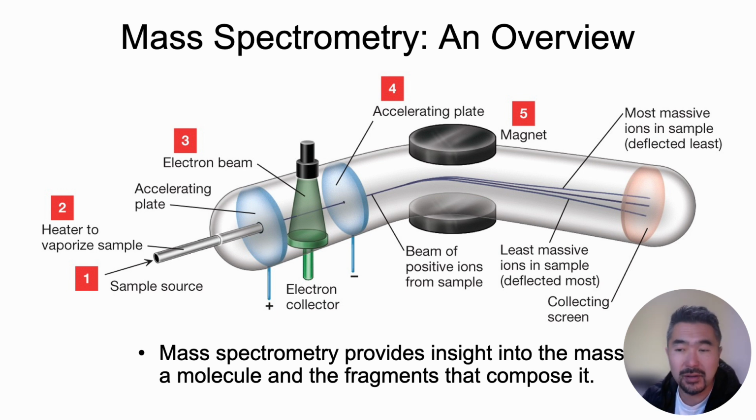This is the first video about mass spectrometry, which again, I hope you're excited about. It's a really useful analytical tool that helps you determine the weight of a molecule. And when you think about it, it's a really amazing thing because a molecule is a super tiny thing. So this is kind of like a scale that is able to weigh such a small, microscopic object, I mean, you can't even see it with a microscope, right?